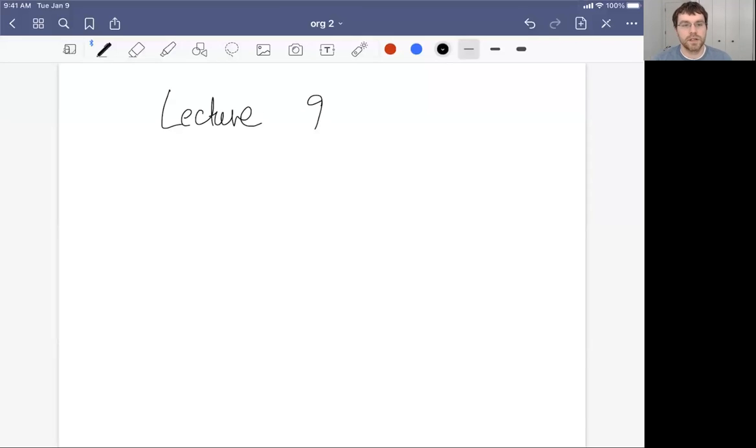In this lecture, we're going to start going into the actual data that we can acquire from a 1H or proton NMR experiment. And this should, for the most part, correlate well to all the nuclei. In fact, the 1H NMR spectrum is probably the most complicated, but the complications make it the most useful. And once we learn it, it just makes learning all the other nuclei all the easier. So the focal point will really be 1H or proton NMR for the remainder of the section, with a few discussion points about carbon-13 NMR, for example, in later lectures.